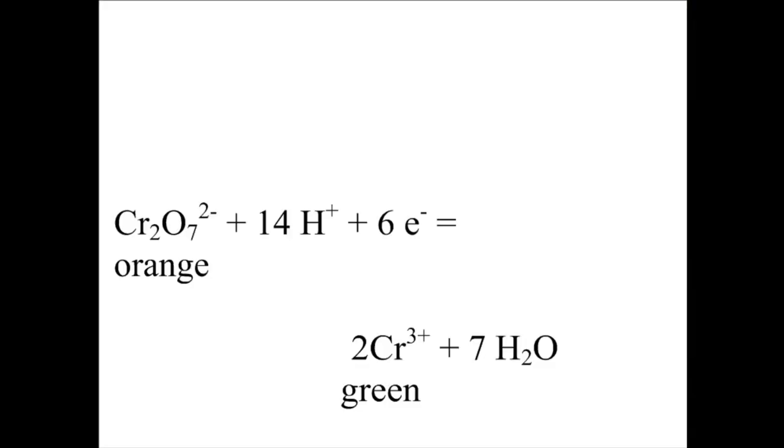Look here and you'll see that chromium has been reduced from the plus 6 oxidation state where it's orange to the plus 3 oxidation state where it's green.